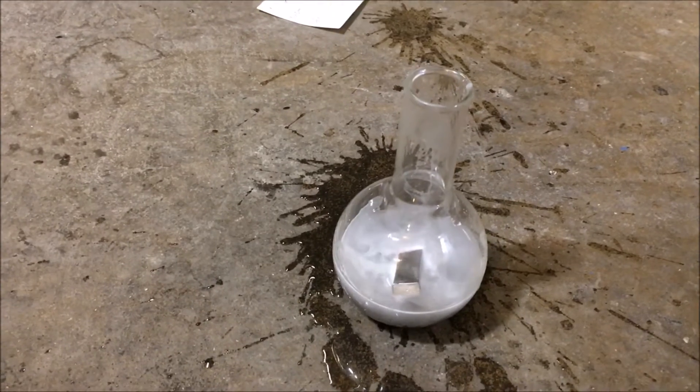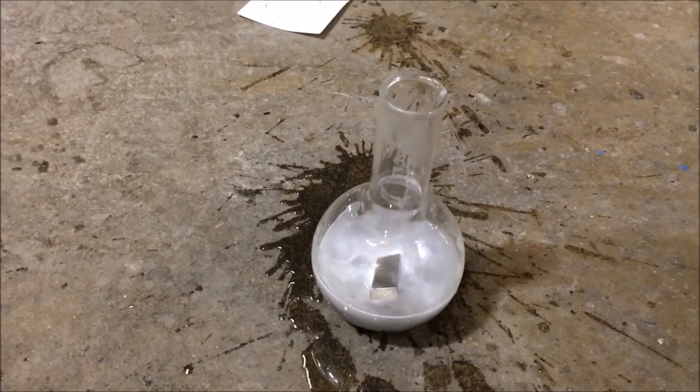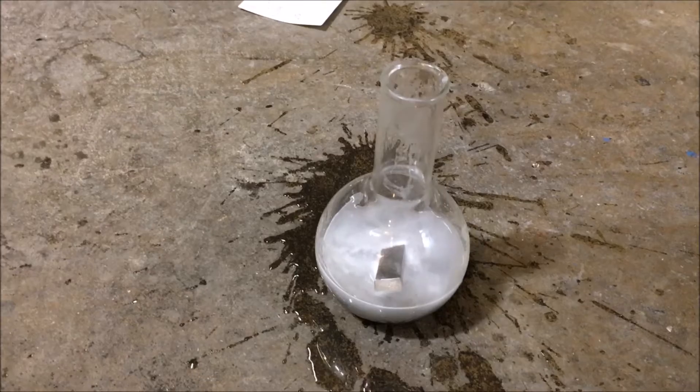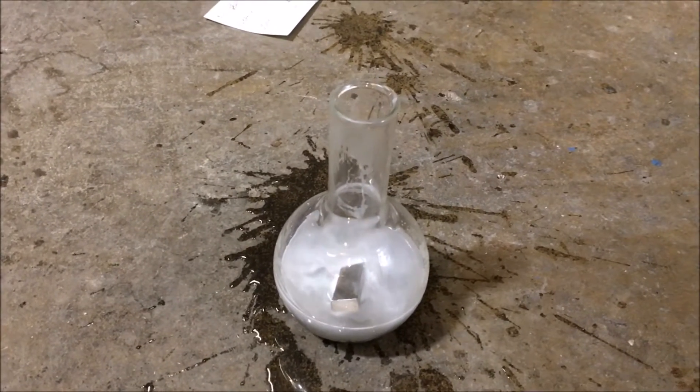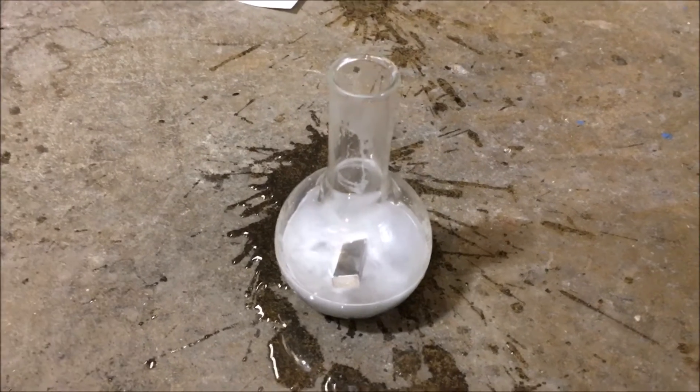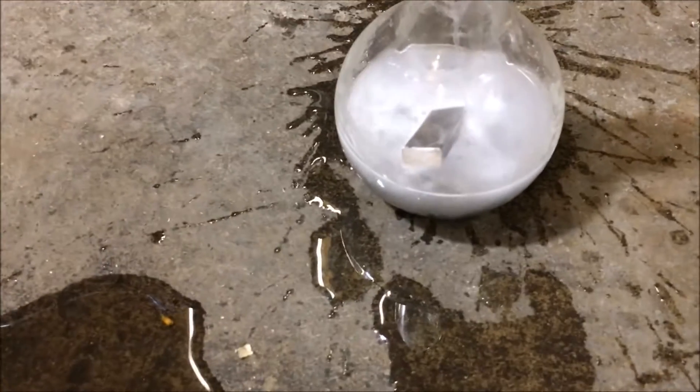I definitely need to rethink this. Right around 170 degrees — things just took off.